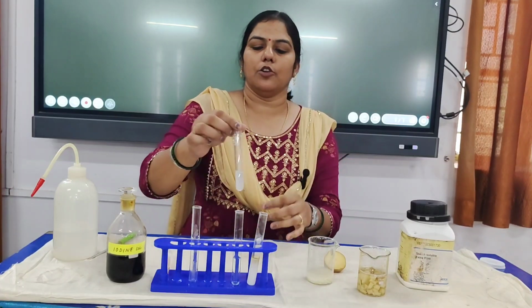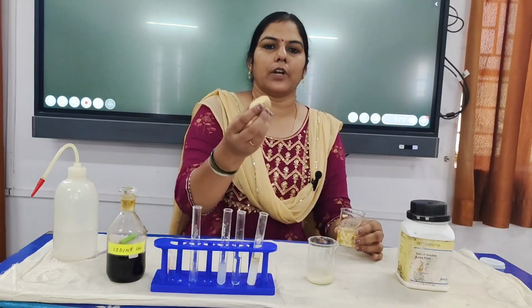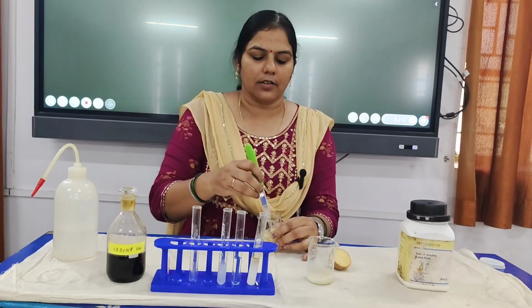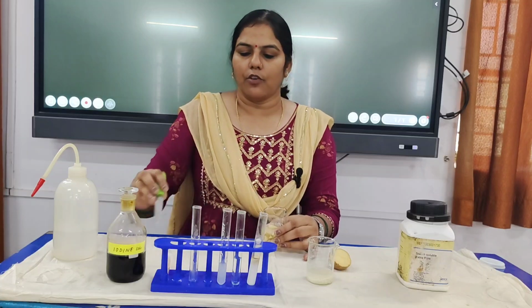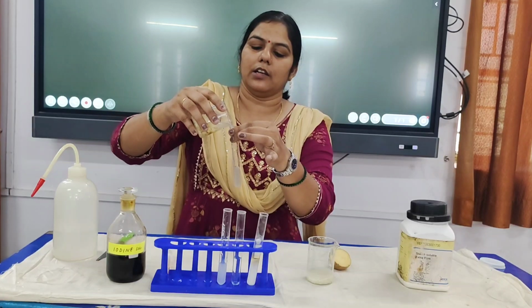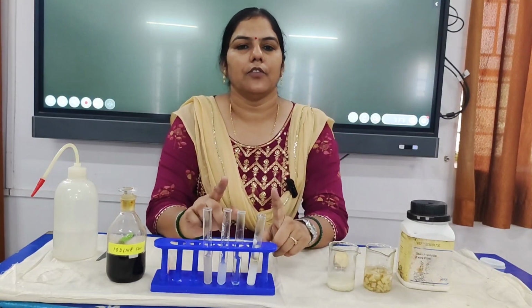So this third tube is rice water, and for our fourth tube I have taken a potato and chopped it roughly and added some water so that the starch from the potato is mixed in the water. Now I am going to add this potato water in the last tube, and this will serve as our fourth tube. Now I have four tubes.